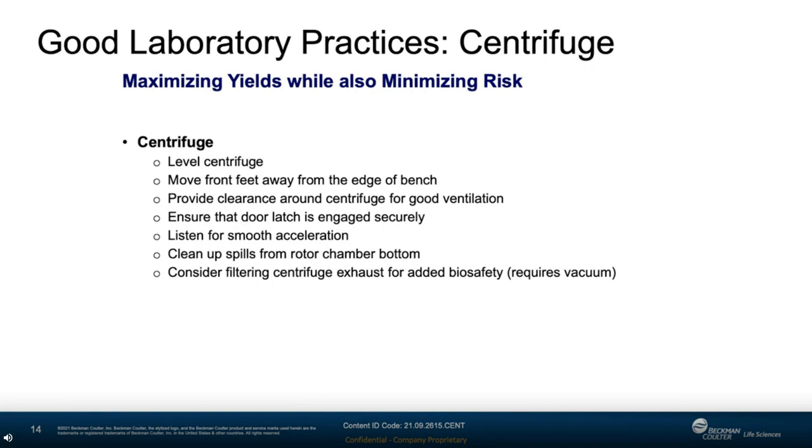I worked in 2 different labs where I was considered a mechanical genius because everybody thought I could fix any piece of equipment, but I have to put air quotes around fix because all I really did was clean the equipment. Once a centrifuge was, air quotes, broken because the lid wouldn't latch and it wouldn't turn on. A really quick visual inspection showed a piece of tape rather obviously stuck in the latch mechanism. I used forceps to remove it and, air quotes, fix the centrifuge.